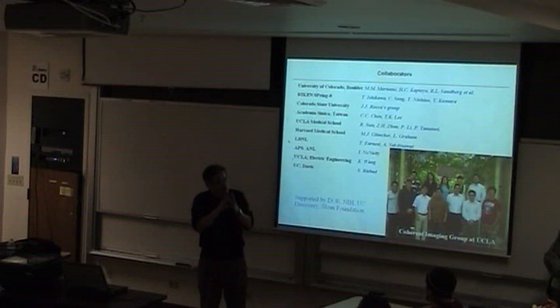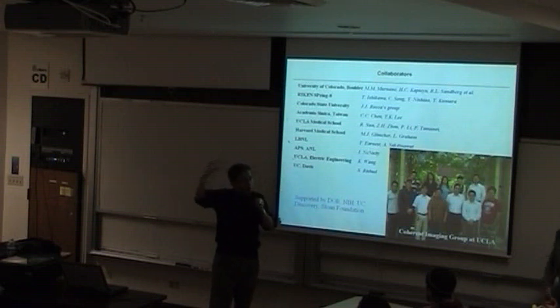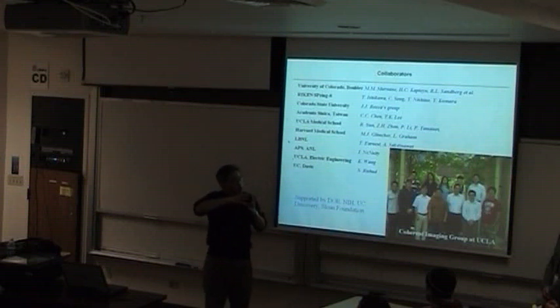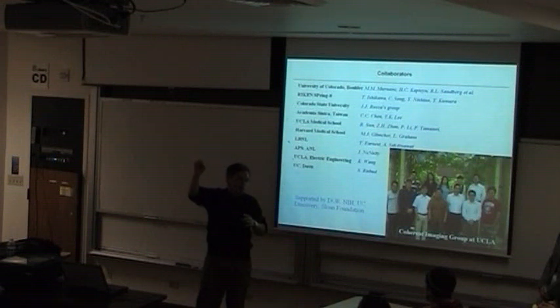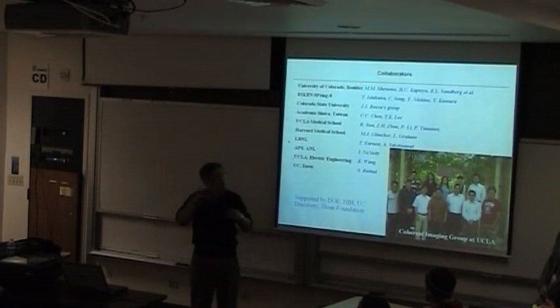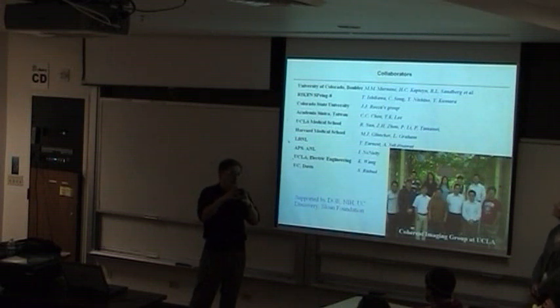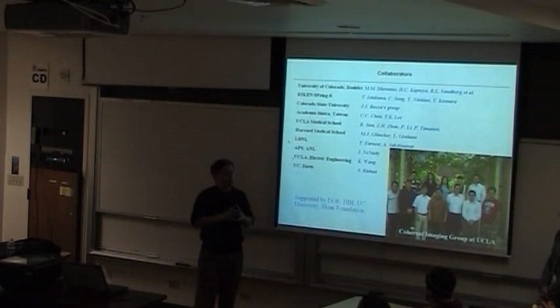If you're oversampling too little, then the number of measured points, especially with noise, you want to measure independent points a few times larger than the unknown variables. Or if you oversample too much, then the signal noise ratio on each pixel would be smaller. So it's a trade-off. We find that the overall oversampling ratio for a 2D or 3D object, a little larger than 4, is optimal. Most of the groups are actually in that range when there's noise.